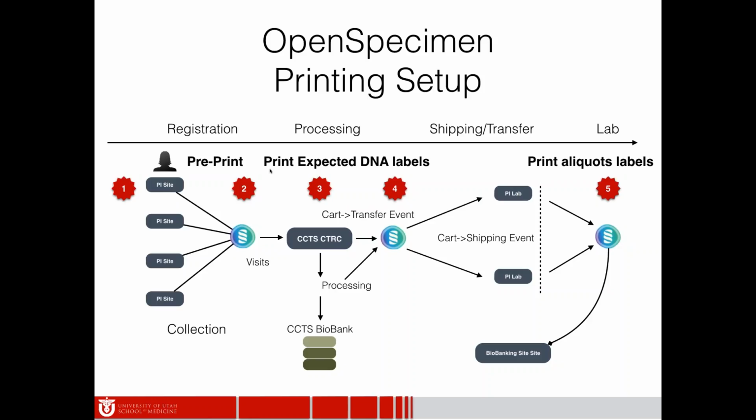Great. And what are these groups using right now? Are they using primarily Excel sheets? It's all over the map. There are Excel spreadsheets. There are folks using commercial products. I think one of them had FreezerWorks. There's another in-house system being used on campus from the Cancer Institute, so some folks will continue to use that, and some people are transitioning from it. And everything in between. People have little FileMaker databases or whatever else set up.